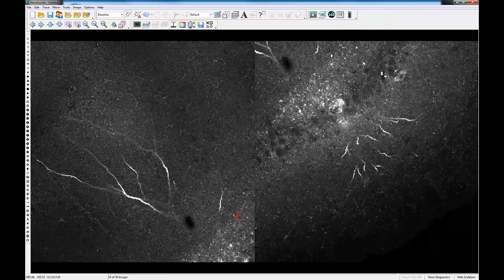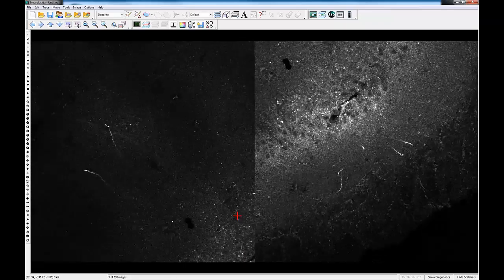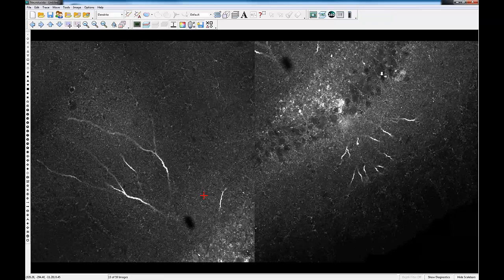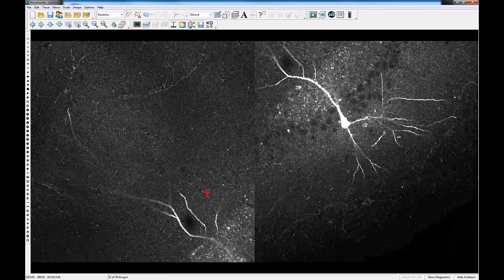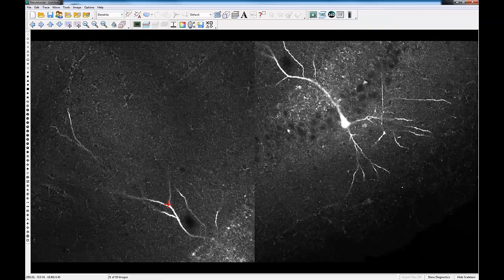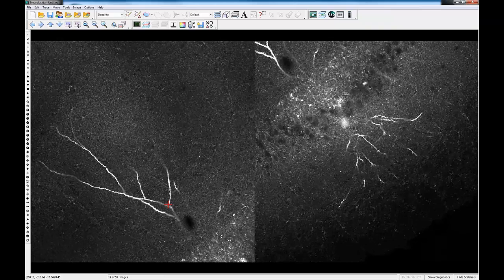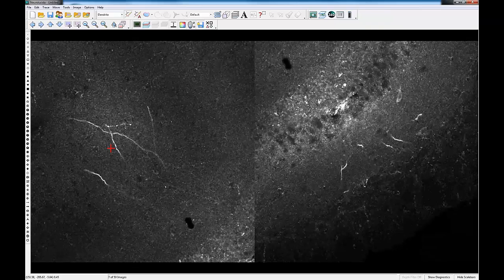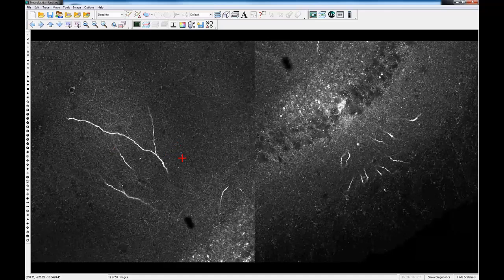I'm just going to quickly demonstrate this microscope-centric view, which is an XY view where I'm paging up and down through the stack. So I'm stepping through the individual focal planes by just going up and down in Z. And you can see that this is a very microscope-centric view, and this is how Neurolucida has been designed to work from its inception, because it was originally working live at the microscope, and now, of course, we allow you the capability to quantify right from image data.